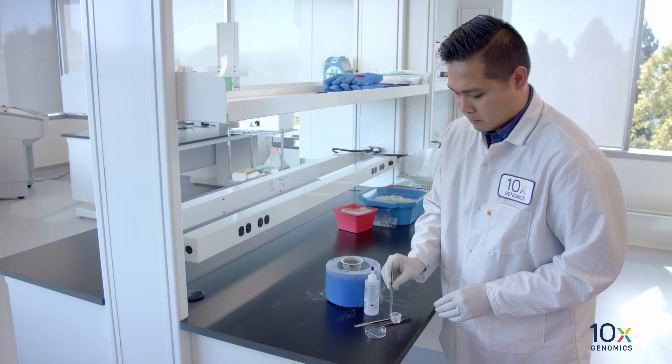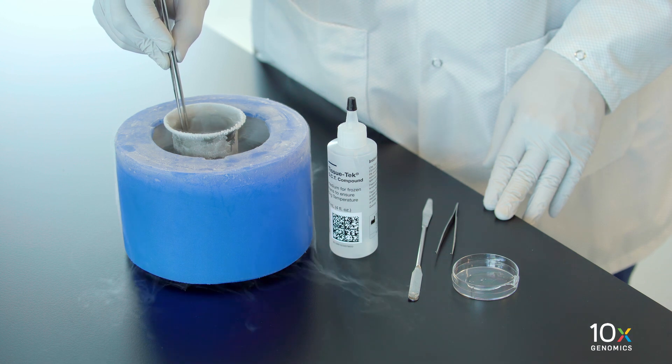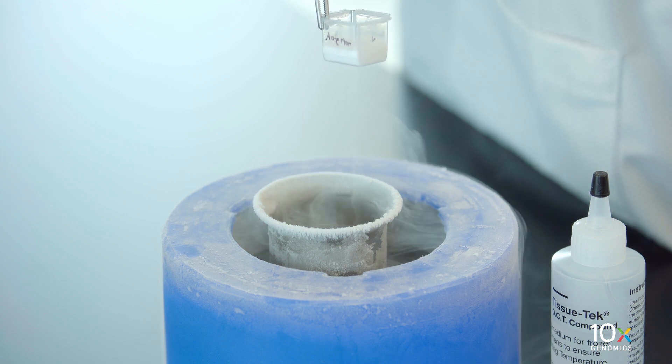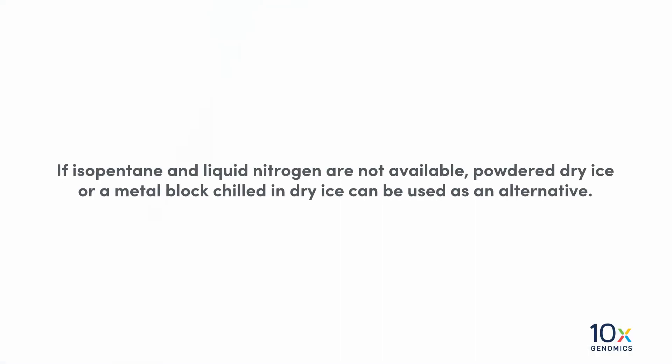Using forceps, lower the cryomold containing embedded tissue into the isopentane without fully submerging. Keep the cryomold in contact with the isopentane until the OCT has solidified and turned white. If isopentane and liquid nitrogen are not available, powdered dry ice or a metal block chilled in dry ice can be used as an alternative.